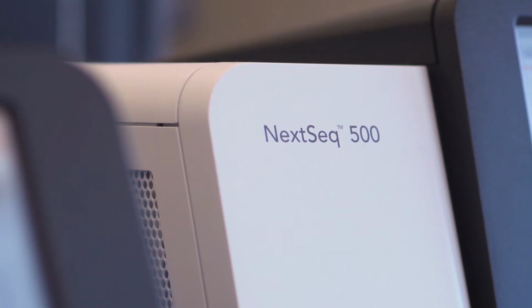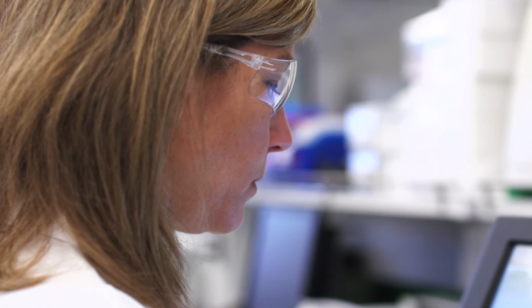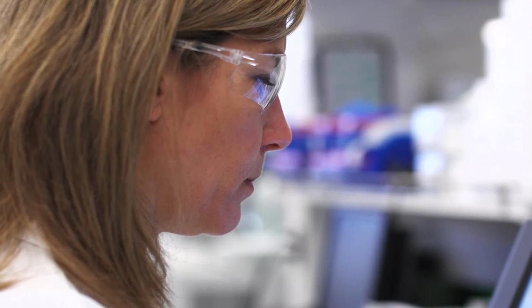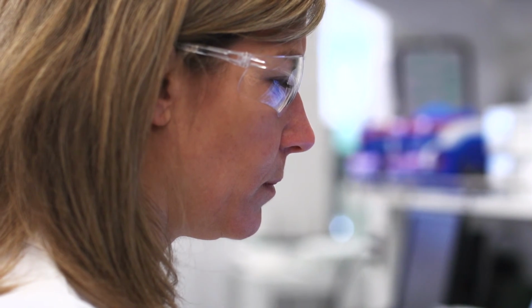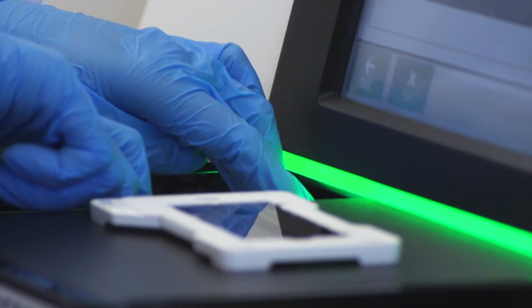The Illumina staff has been very helpful in getting the instrument up and running and our processes in the lab. Both the sales and the field application scientists are very helpful and very responsive, as well as technical support. Illumina technical support helps you walk through any problems you may have.